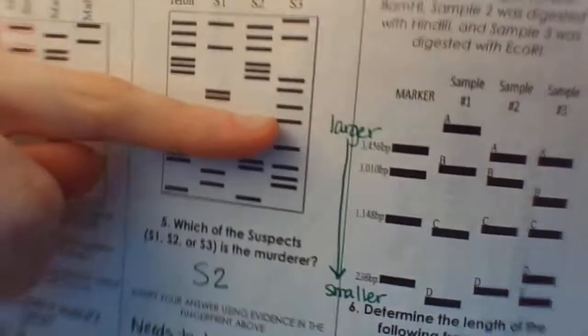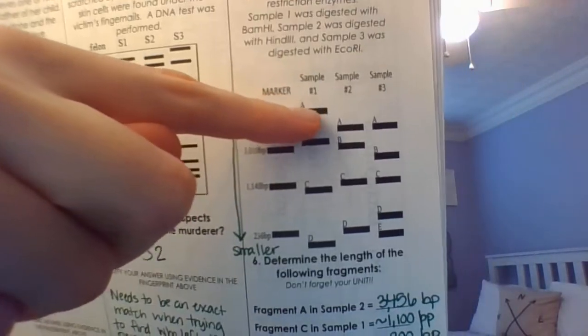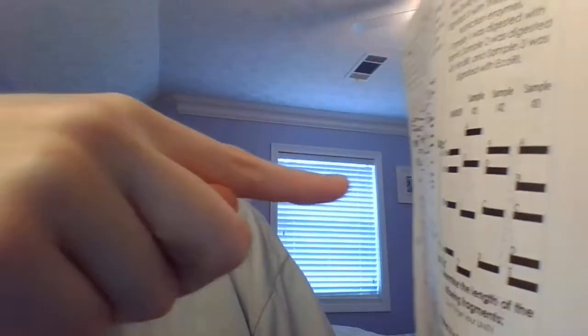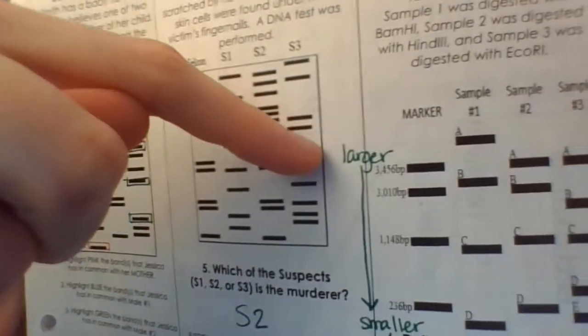Scenario 3, you just have to figure out what are those sample sizes. And remember, you use your marker as your starting point. Okay, so if you have this band right here, you know that they go from larger to smaller, so that this band would have to be bigger than 3,456 base pairs.